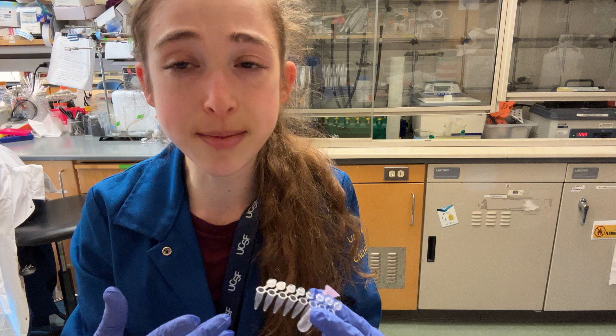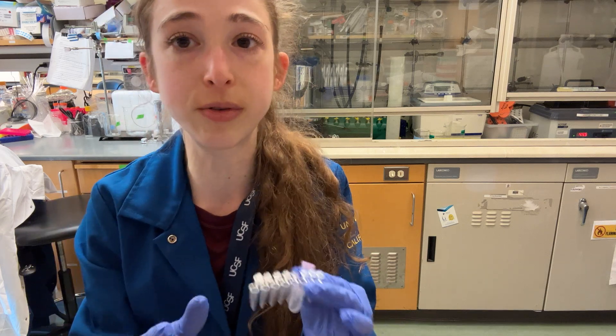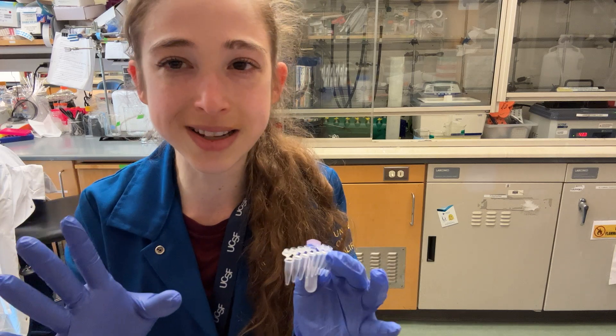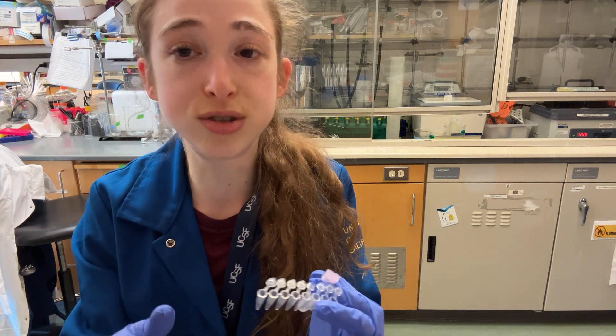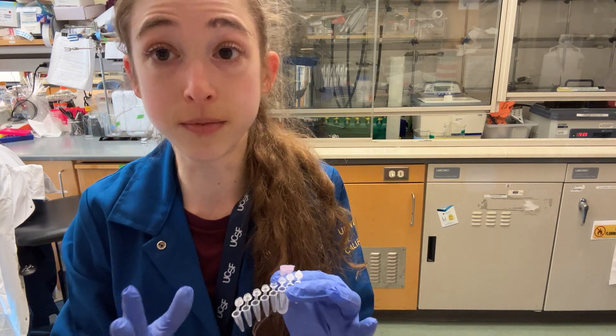Basically there are just going to be really different dynamics. Although the more modern PCR machines try to account for this by allowing you to input the volume so they can change the ramp speed and things like that, it doesn't work perfectly. There are still all those other factors that you have to worry about. So it's really better to just split it up into multiple tubes, especially if you spent a lot of time optimizing that reaction at the lower volume.